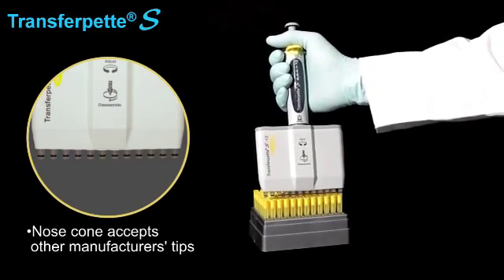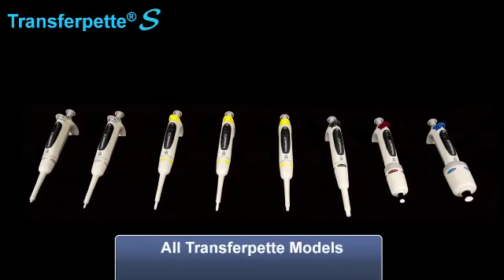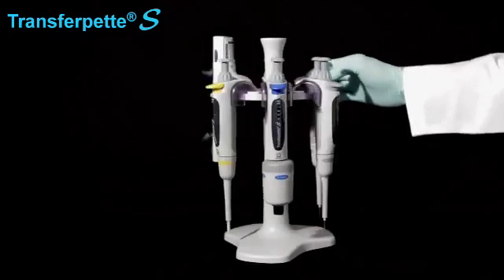All Transferpettes are color-coded by volume for easy identification and selection. A covered nameplate allows for personal identification without the use of messy tape.